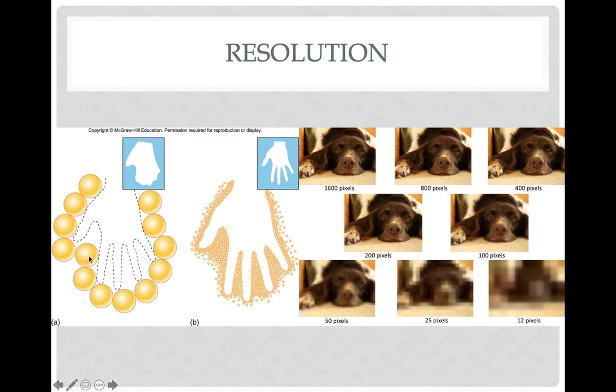Whatever they use to quote-unquote take the picture with to allow you to see, if it's large, you're not going to get as good of a picture compared to something that uses electrons or something smaller to take a picture. So this is the pixelized version of that over here. You guys can kind of get the same idea.